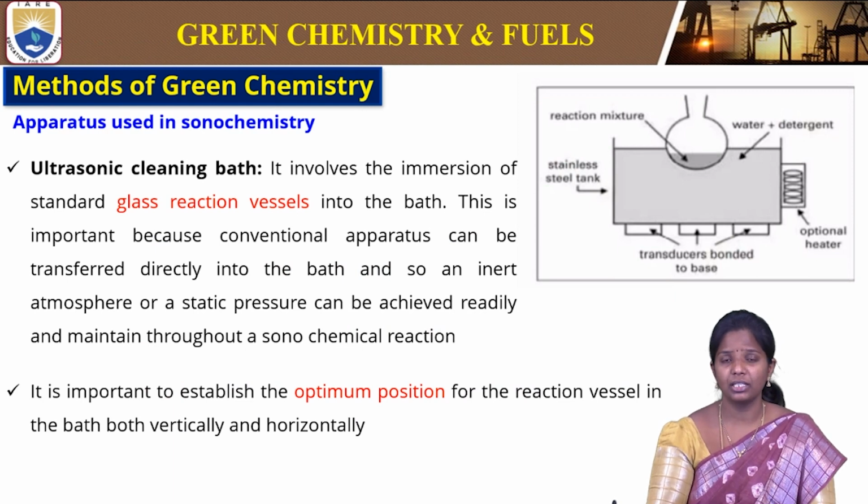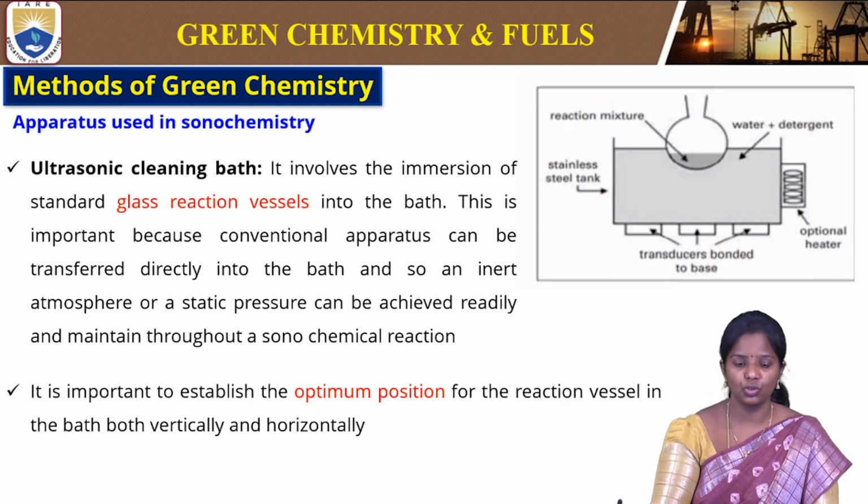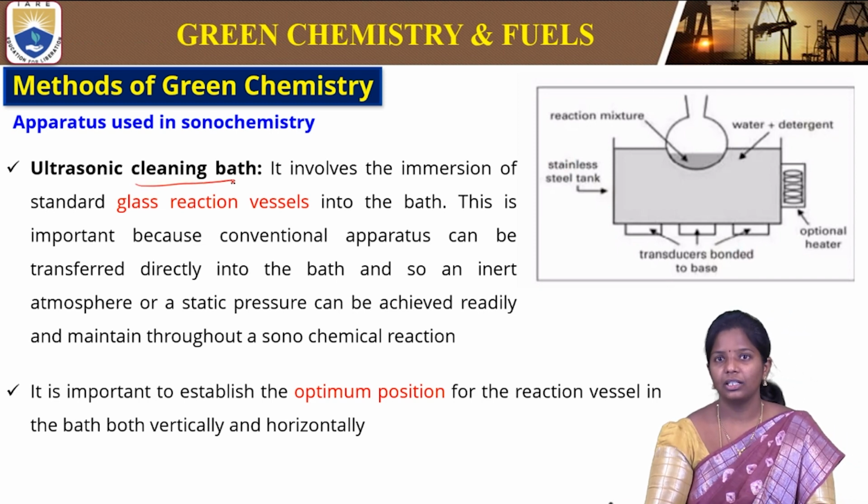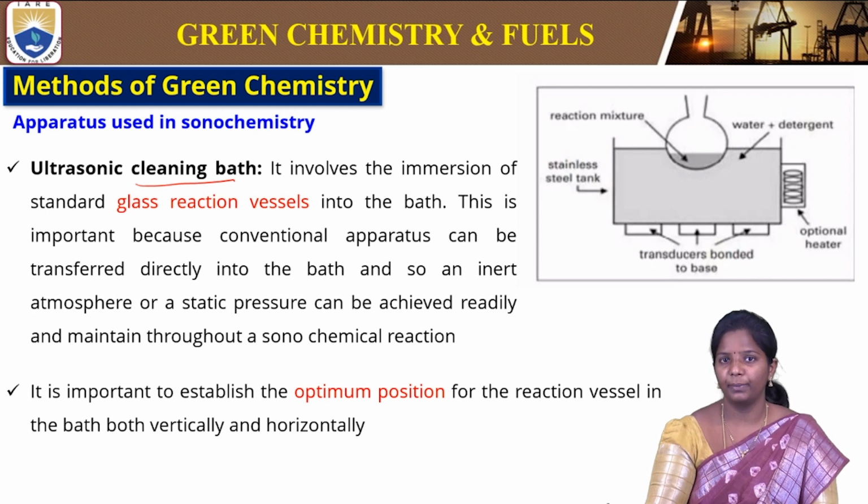So what are the apparatus? Next comes the apparatus used in sonochemistry. Ultrasonic cleaning bath. We generally use the ultrasonic bath mostly in laboratories for agitation and other purposes. Here we are using the same method for producing energy. The ultrasound waves will favor the synthesis of any chemical reaction.